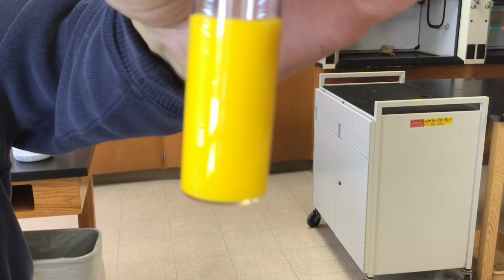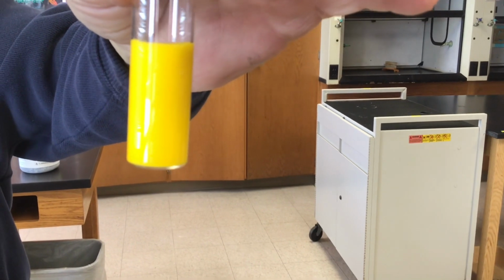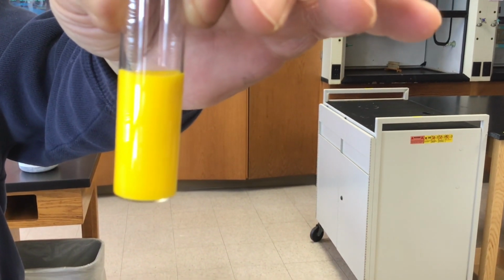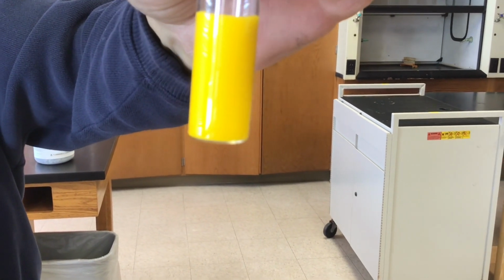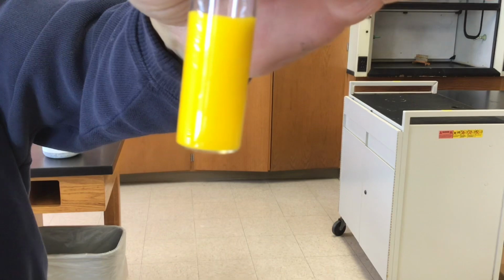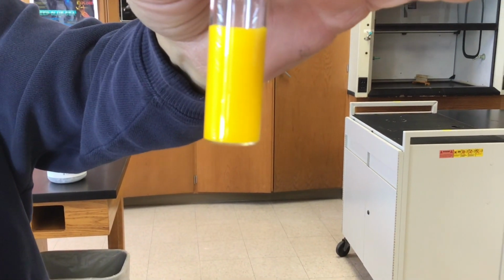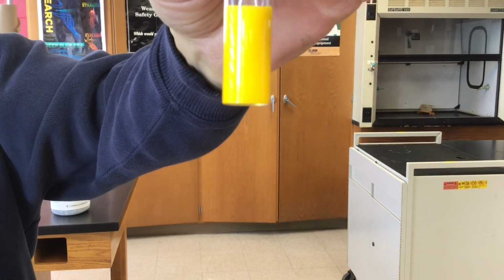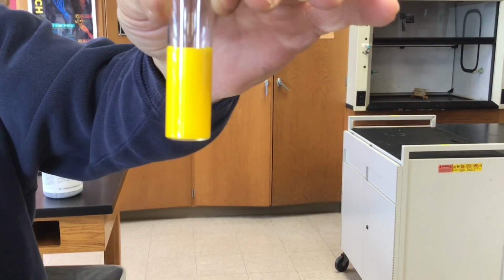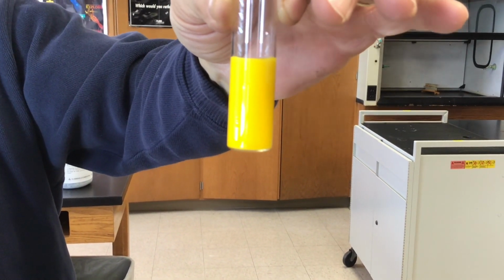Now you notice you cannot see through the test tube anymore. So, a true solution where something's dissolved in water may have color, but it'll be transparent. You'll be able to see through it. And that clearly is not happening here. It's like there's a solid blocking the light from getting through. There's a solid that's formed. I don't know how quickly it'll settle, but if we let it sit for a while, gradually we'll be able to see the solid fall to the bottom.